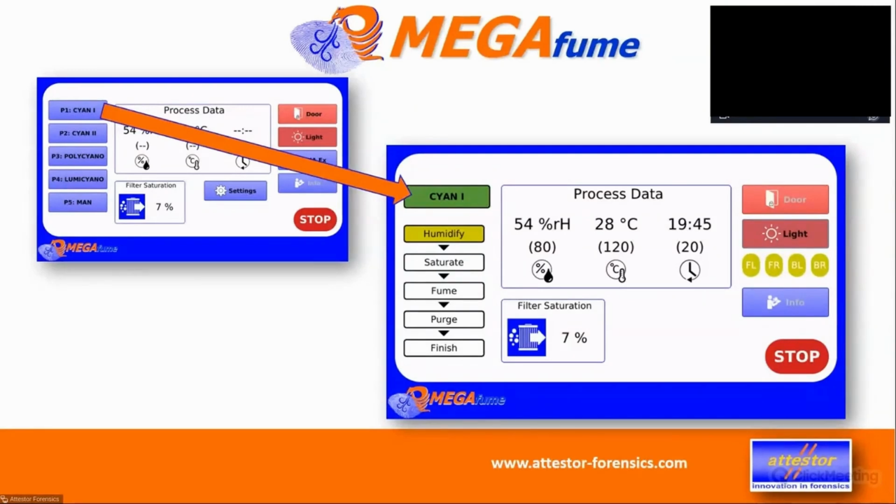Sometimes, let's say you do a plastic film or a drinking glass or something, it is quite good for monitoring the development if you have the light coming from behind and not from four sides. So you might want to be able to switch off the front lights or the right lights or the left lights or the back lights, whatever you think is best for that particular sample.